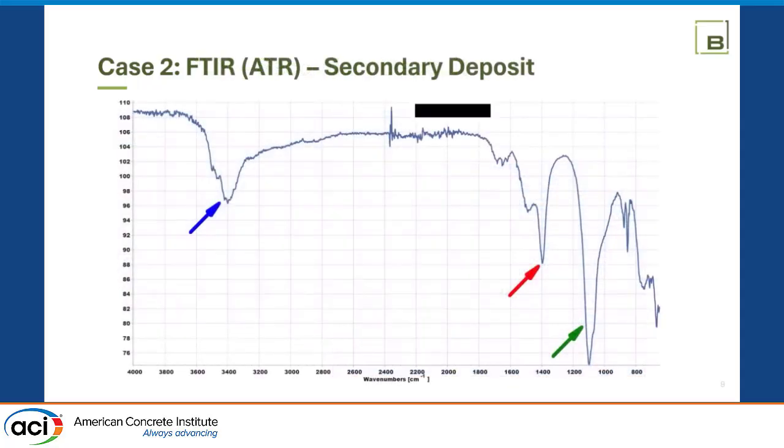With the FTIR on the ATR attachment, we can go through and scan that real fast, and we see very clearly we've got a blue arrow over there pointing to the water peak. We have water. Over there we have, in green, our friend at 1100, the sulfate peak, and a new guy at 1400, which is your carbonate peak. So we have something that has water bonded to it, sulfate, and carbonate. And that is thaumasite. So what took me days to prepare, I could get a good reference understanding of in like 60 seconds.